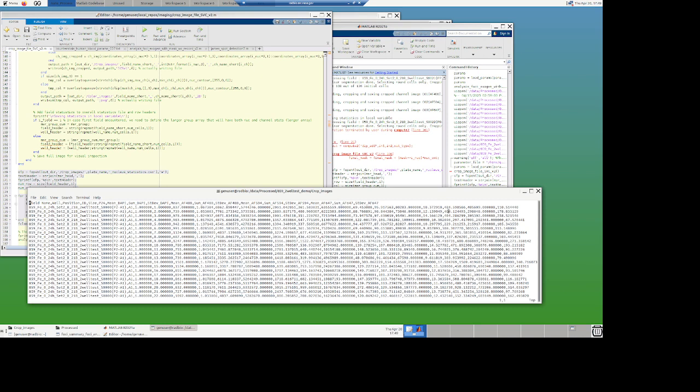Very grotesque at the nuclear level, but I created this. That you won't have if you're using the benchmark that I said. That's new. I created this recently.